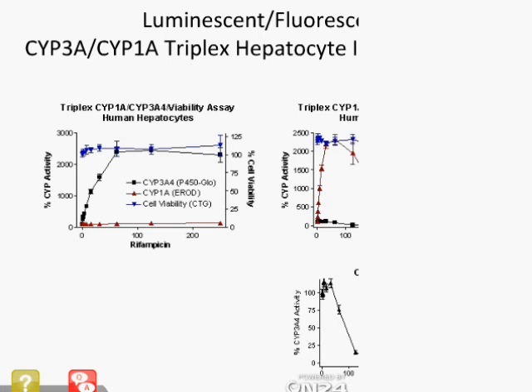When you look at all the assays together on this one graph, it's hard to see what's going on with 3A4, but when you zoom in on the 3A4 result, as shown on the bottom graph, you see that over the course of treatment with omeprazole the 3A4 activity also appears to decrease. And this makes sense because omeprazole is a 3A4 substrate. The more omeprazole present in the system, the more it competes with the 3A4 IPA reaction. So you see a decreased activity due to competition and inhibition.